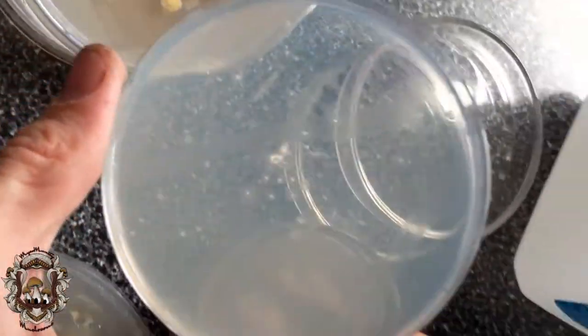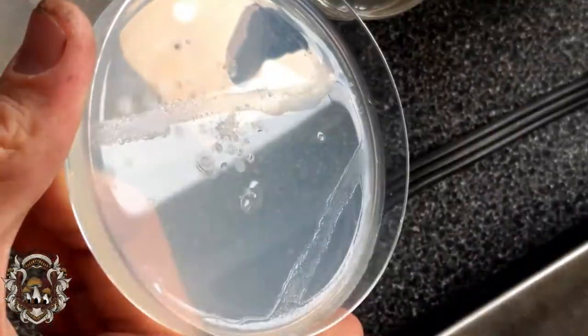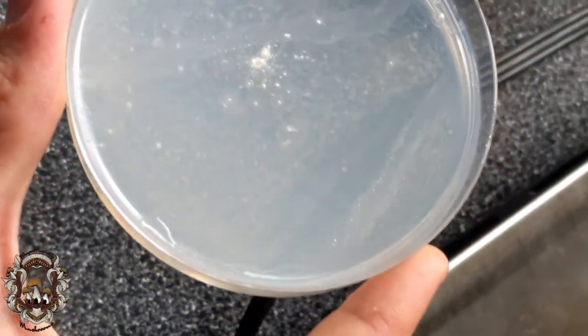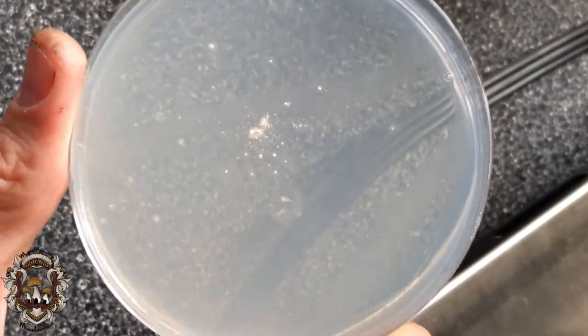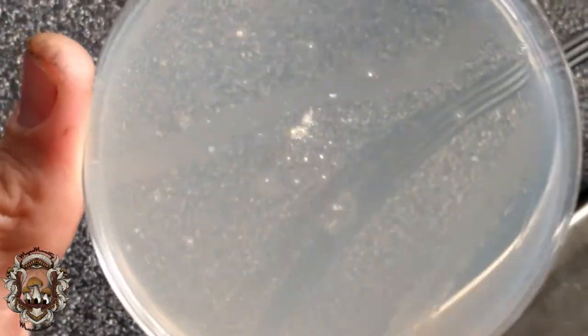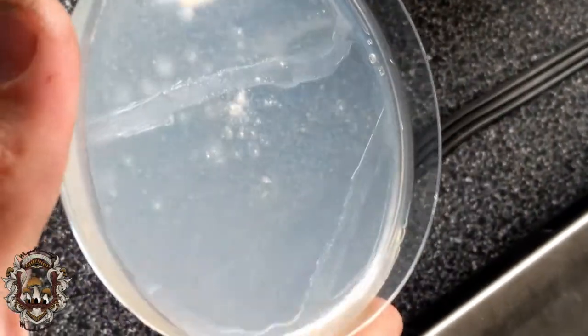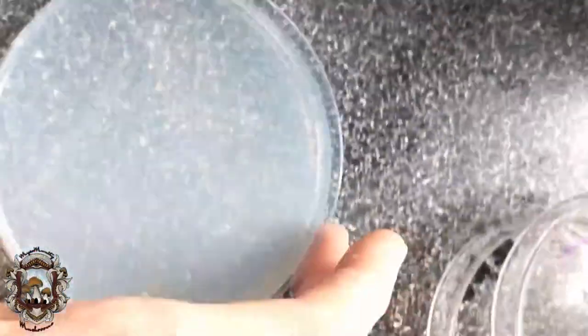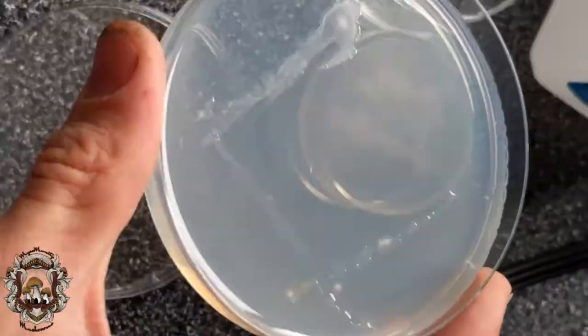Like I might have mentioned before, I mainly wanted to do this just to kind of get an idea of what the product is. This is it on water agar, so nearly no growth, which is good, I guess. I'd say about no growth, really. This was actually just powder on the water agar. That one for last. This is the liquid solution smeared onto the agar.